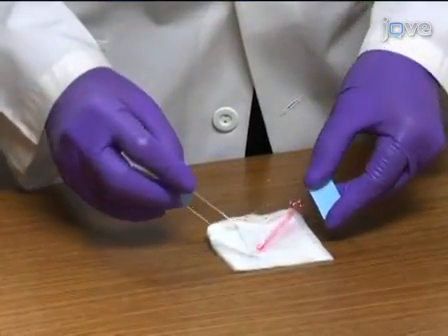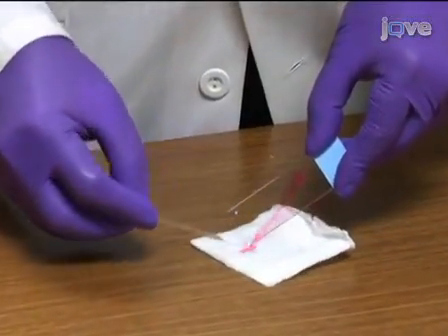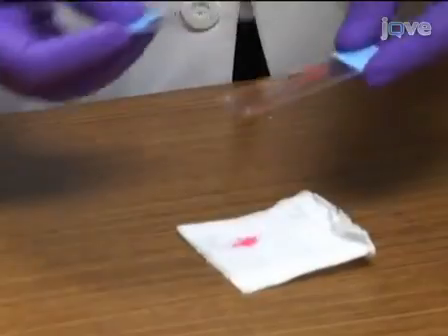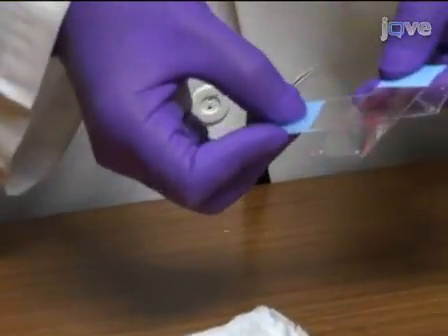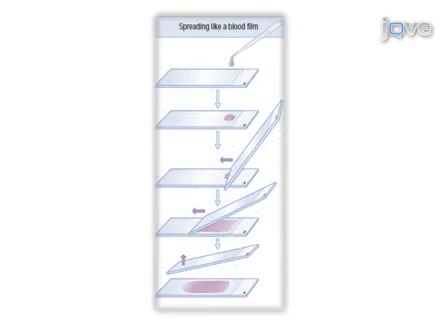Should an actual specimen be diluted with blood, drain away the excess blood by tilting the slide before placing the second glass slide on top. If the aspirate is predominantly a suspension without microfragments, such as from lymphoproliferative lesions, it can be spread using the ribbing method, where the edge of one slide is used to create a rib-like set of smears on another slide. Or the spreading method can be used, where one slide can be used to create a film on a second slide.